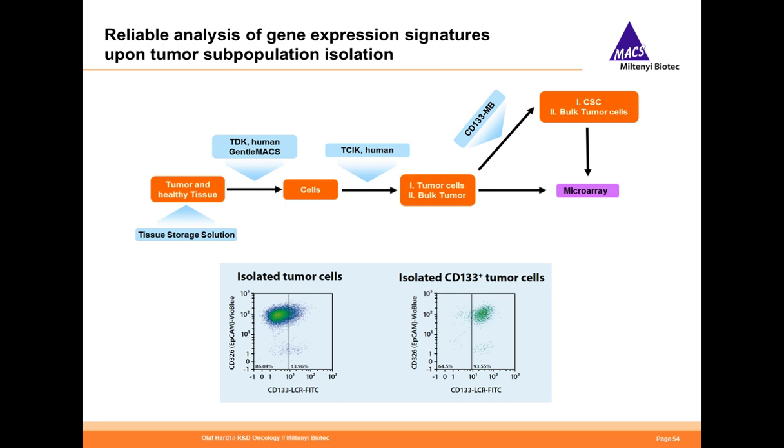So very briefly, I want also to touch on RNA analysis, because this was DNA analysis, but of course you think RNA adds another level of complexity, because here you not only have two information points per cell, like in a DNA based on the chromosomes, but all the different RNA species will have very different expression levels. So there it's much harder to really dissect bias from the real events.